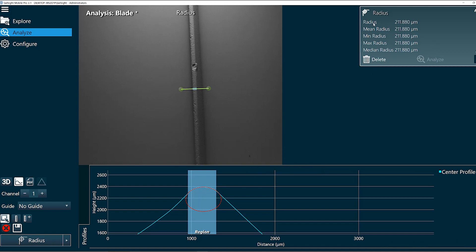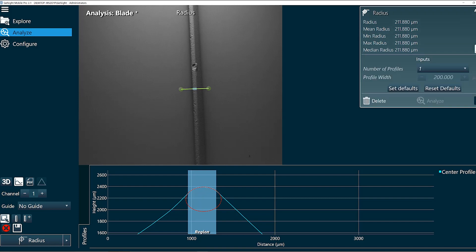And you can see the result of the radius function in the top right corner. I'll click the pencil icon so we can see what the advanced settings are. Here we can see we have an option for number of profiles and profile width.